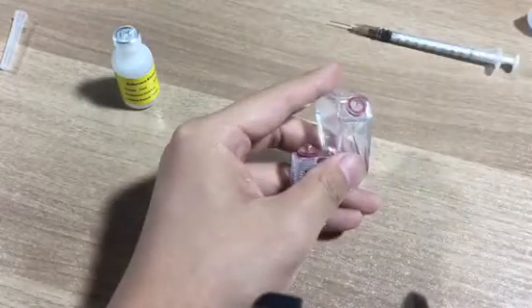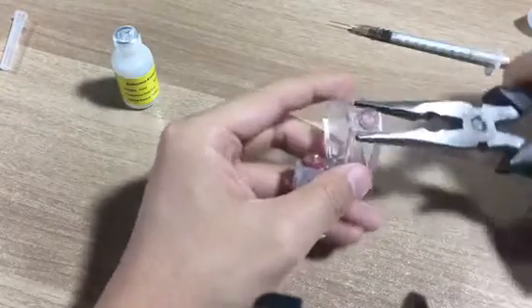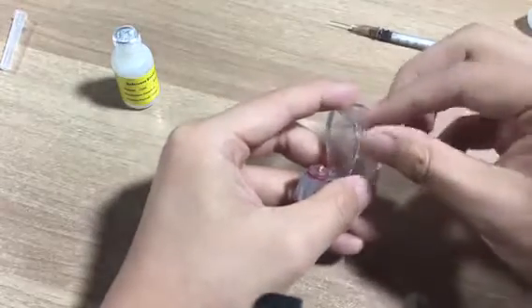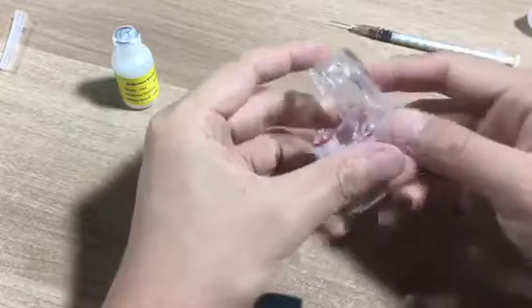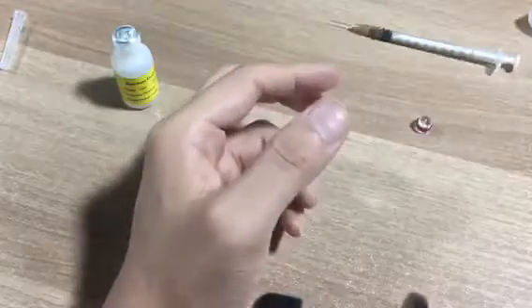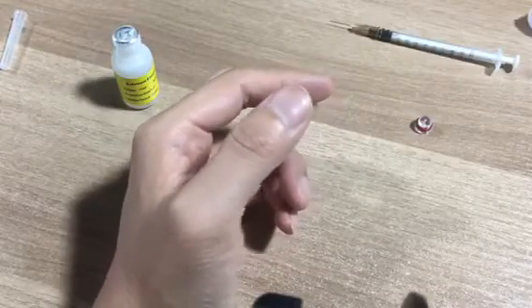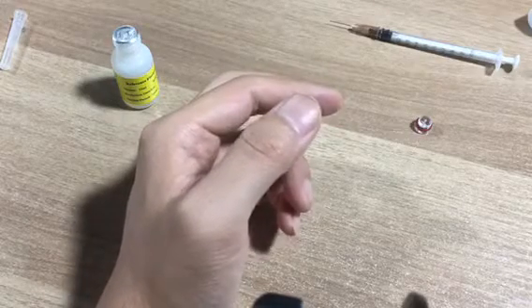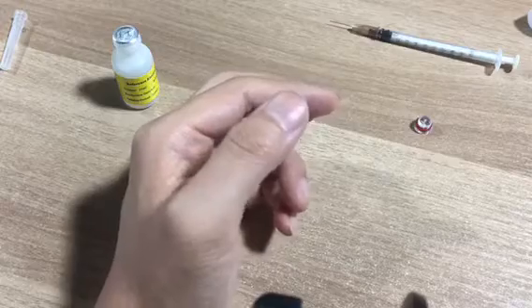First we need to remove the electrode solution out. We use a clipper to take the cap away. Then take out the solution and throw it away.